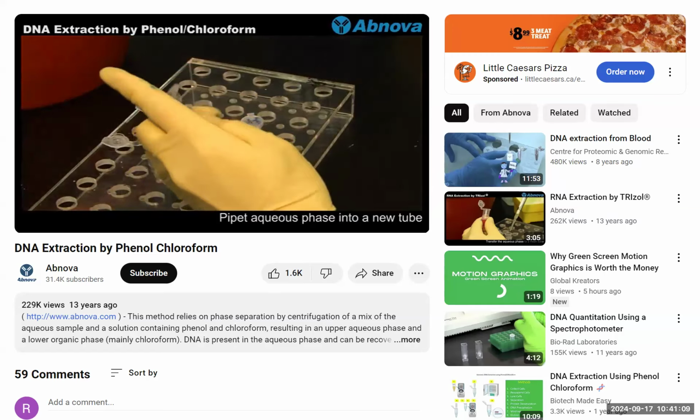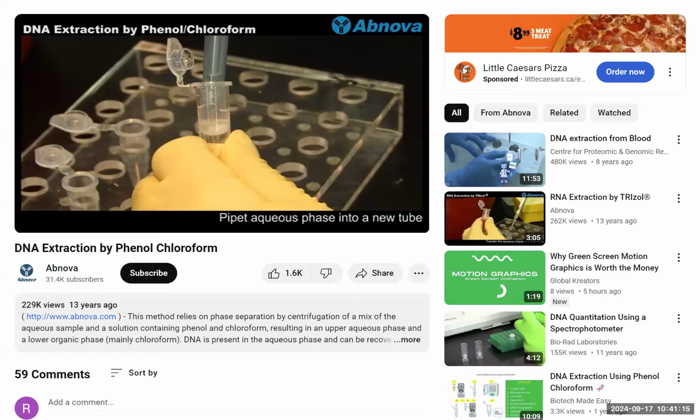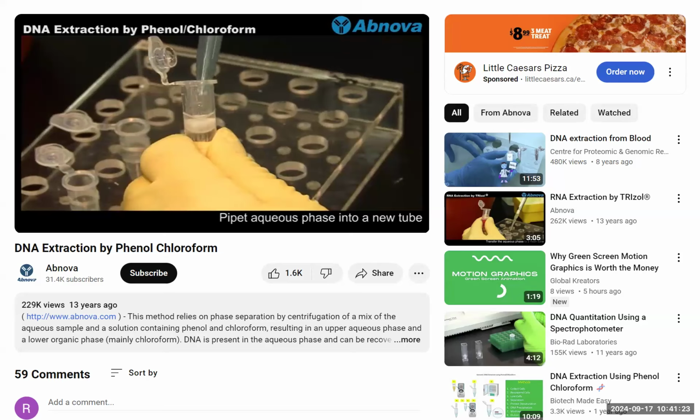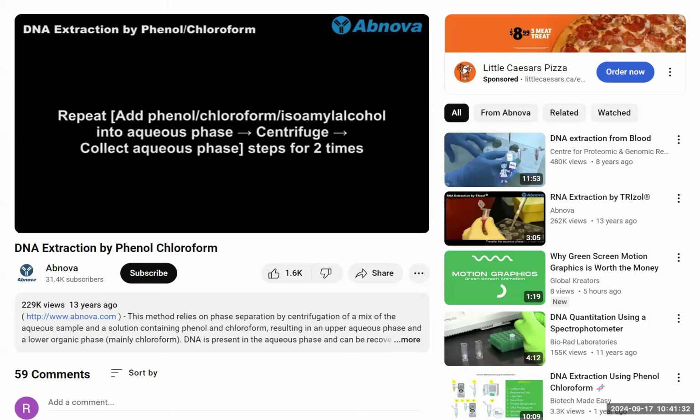After separation, you got the aqueous phase, which is on top. And that's recuperated. And you can see the white interface. You want to avoid this. So the nucleic acid are already on the top, or DNA, in fact, because the RNA is degraded. You can repeat this many times to get a better quality.